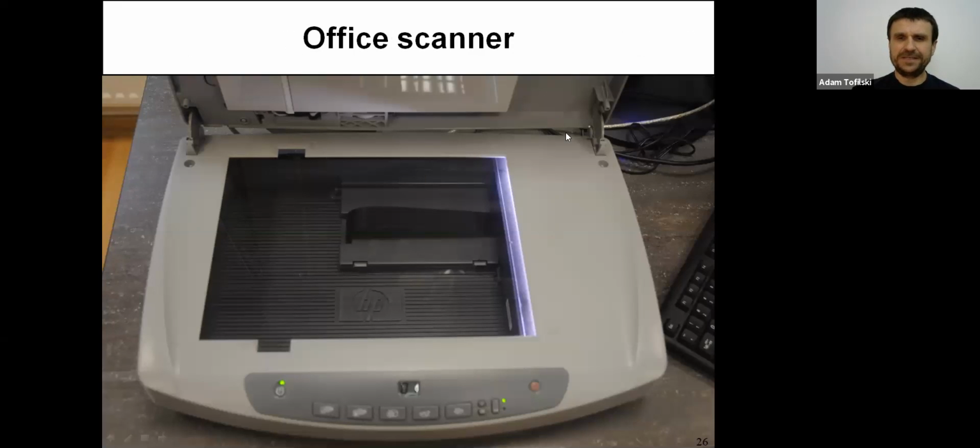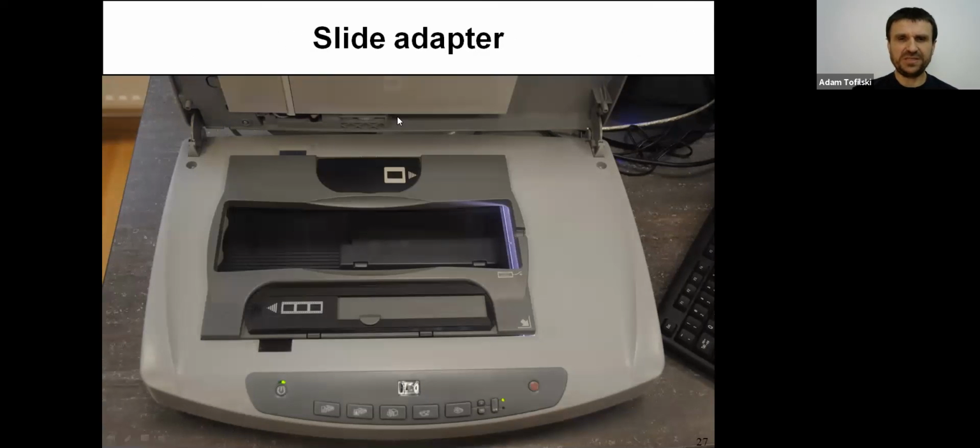If you open the scanner, you can see the area where you can place a piece of paper. However, for wing measurements, in this place you put a piece of plastic with a space where the slide adapter will be. In this space, you can place a wing, or even 10 wings, and then you should cover the wings with a piece of glass. It can be a microscopic slide. Then the wings are lying on the glass and are covered with the glass, so they are flat, and the image should be good.